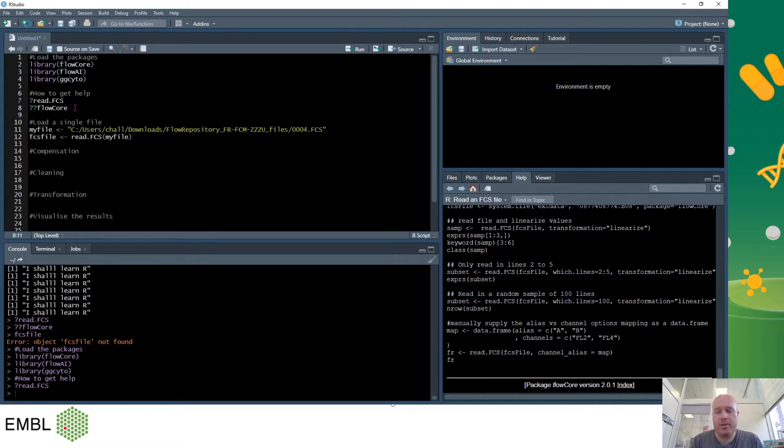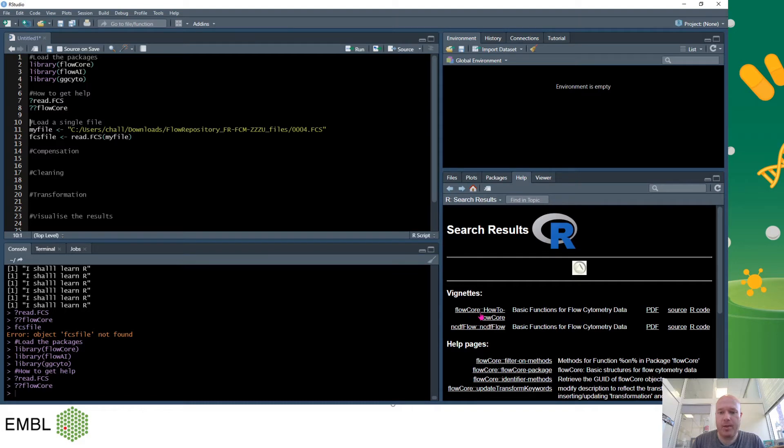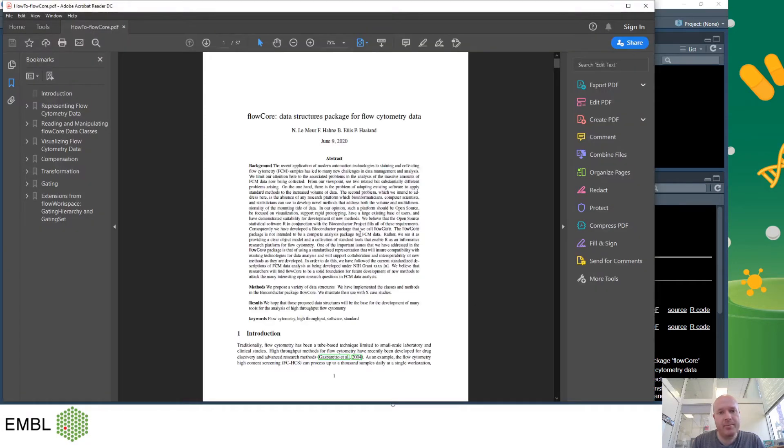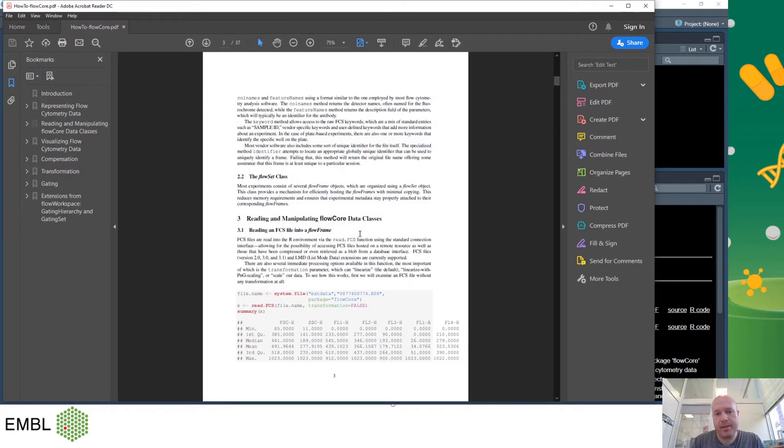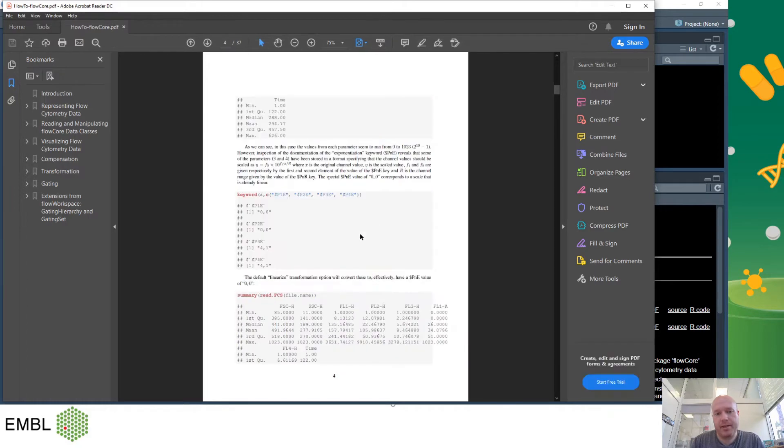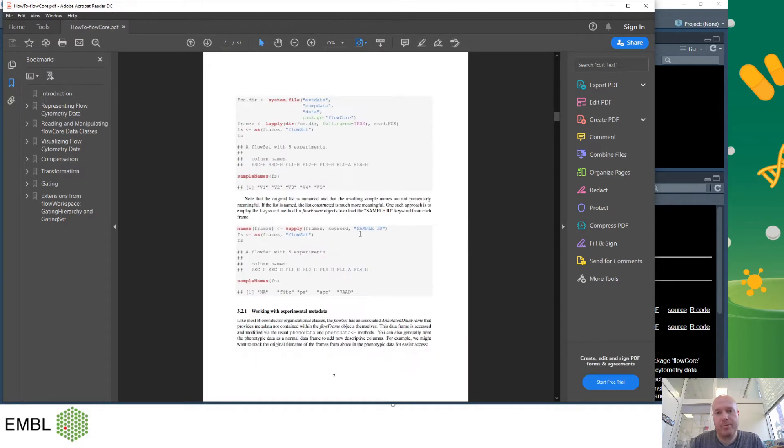If I want to know about the package in general I can use two question marks and the name of the package, in this case flowcore. This will search all of the help and here I have the top flowcore how to flowcore. Click on this will take me to a PDF or to a help page and this particular one takes me to a tutorial of how to use flowcore.